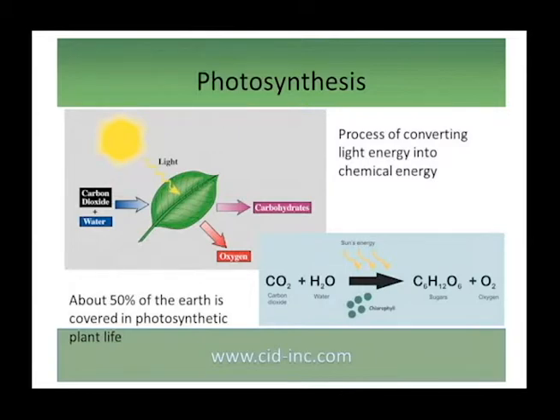So here we see a very familiar formula for photosynthesis, and we're going to measure the carbon dioxide assimilation with the handheld photosynthesis system. And again, photosynthesis is extremely important and heavily studied, as about 50% of the Earth is covered in photosynthetic plant life.